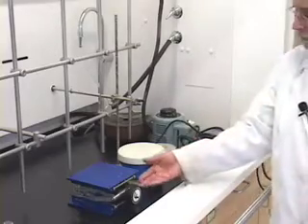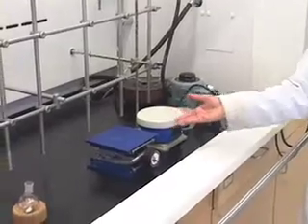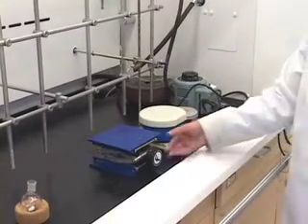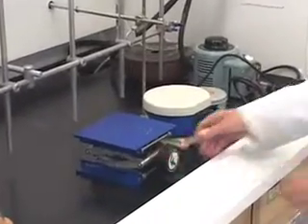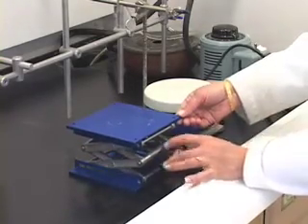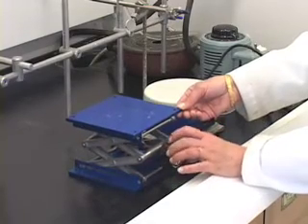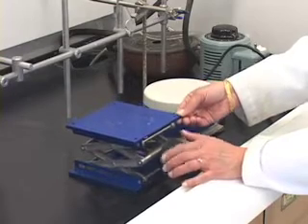The next piece of equipment that we need is what is called a jack. What does this jack do? Just like the jacks that folks keep in their cars when they want to change the tire, this also does the same thing. You can raise the level by using this dial, or you can turn it anti-clockwise to bring it down.